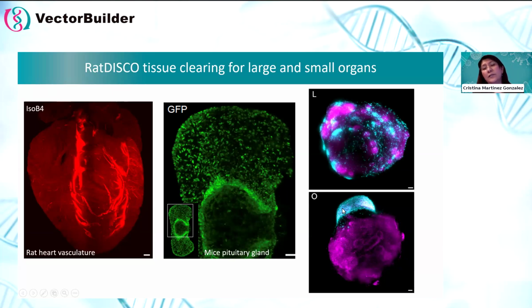And if the tumor cells are just located, encapsulated in one single structure without being disrupted, basically the spread of this glioblastoma is not so extensive. This is a model for a group that is working on glioblastoma, one of the most dangerous types of cancer in the brain, and they are trying to study metastasis with this.